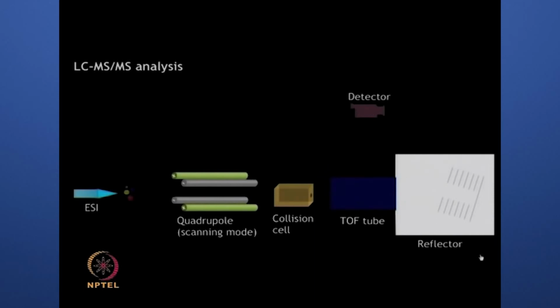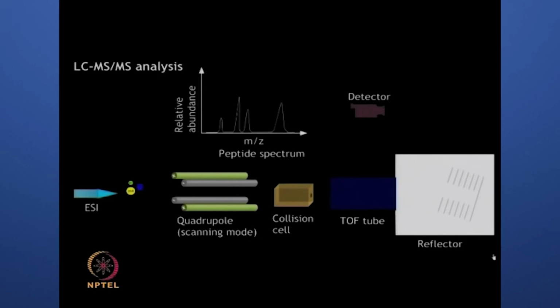The purified labeled peptide fragments can be analyzed by MS. The different masses of the reporter group allow the peptide fragments to be identified. The reporter group is lost during the fragmentation step. The relative quantification of 4 samples or 8 samples can now be performed in this way.